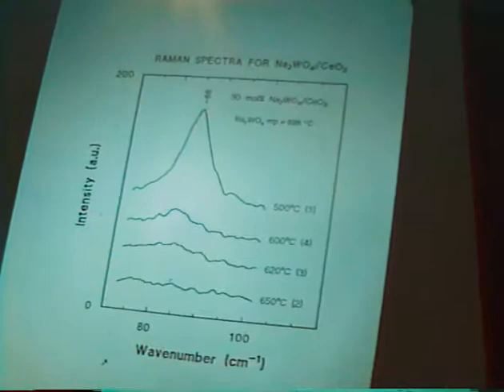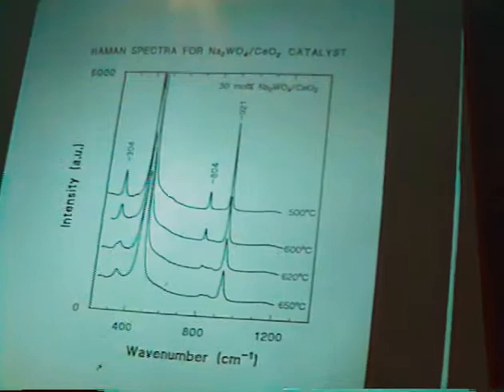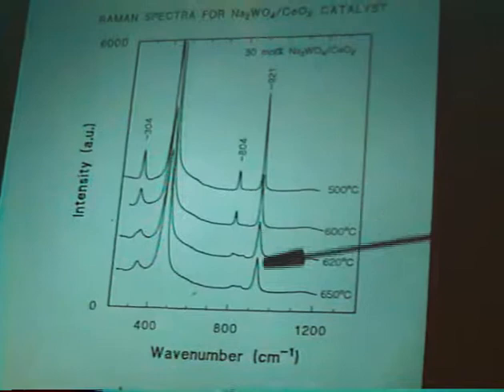Now, of course, the vibrational modes of the tungstate ion itself will not be so affected by increasing the temperature. And here we find that these modes are essentially present. They decrease somewhat in amplitude and broaden.